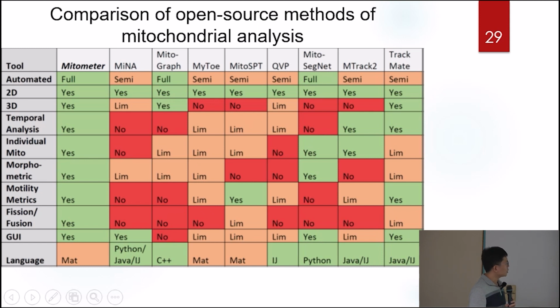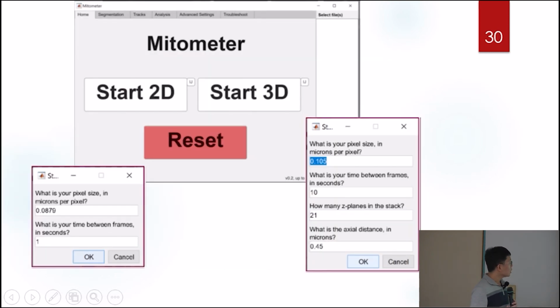And the GUI, which is a graphical user interface, is pretty friendly for users, especially for people like us who are not that good at programming. Others are also okay, and actually most of them can integrate into ImageJ, so you can use them more easily. Okay, so it's almost there. In the following few slides, they show you how you can use this.